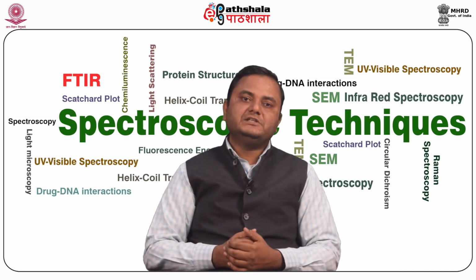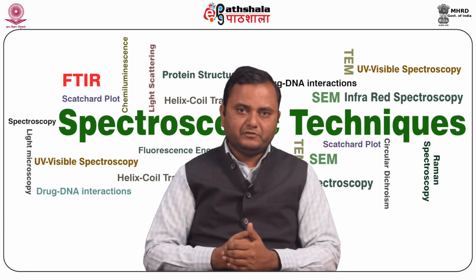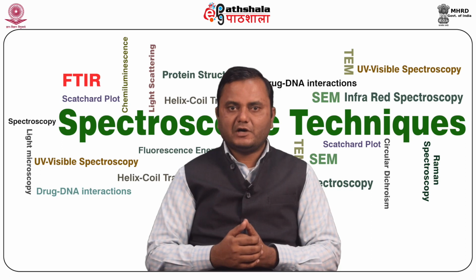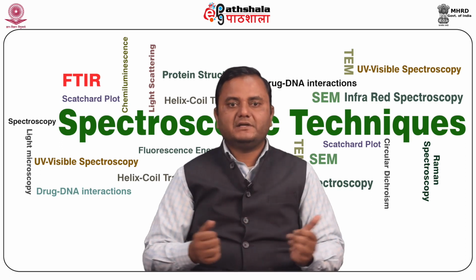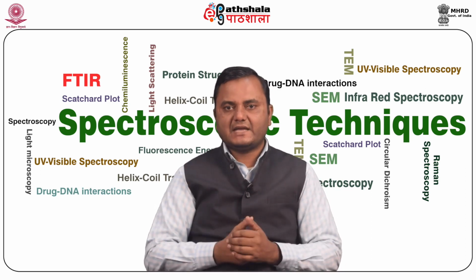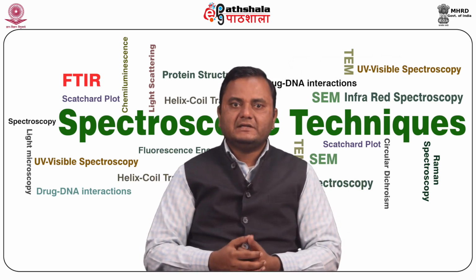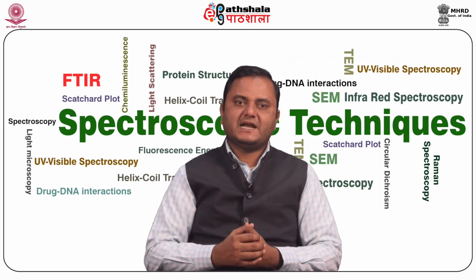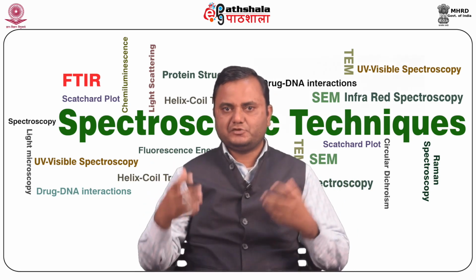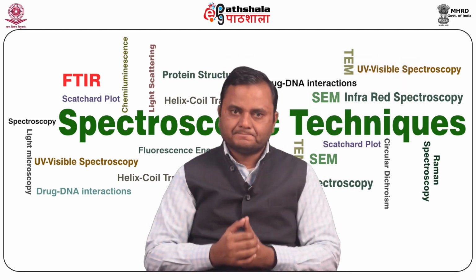Now we talk about the key functional groups by region of the IR spectrum. Two factors influence the energy, and thus the wave number, at which a bond absorbs: the bond strength and the atomic masses. The type of bond, double, single or triple, decides the strength of the bond, and atomic masses determine the vibrational state of the molecule, like a spring.